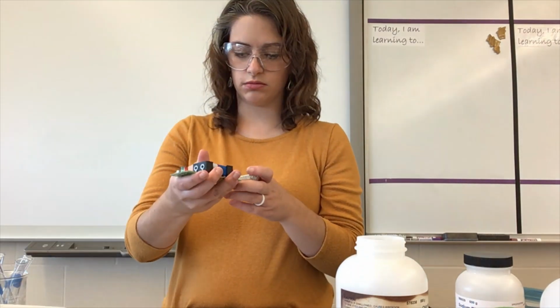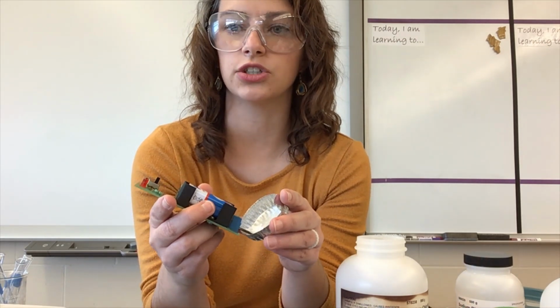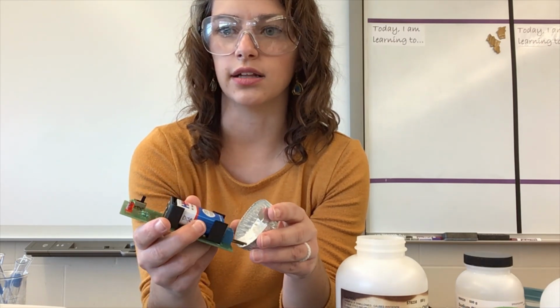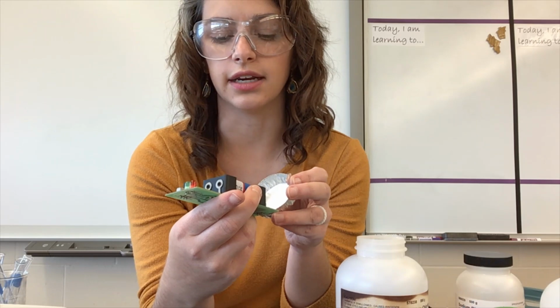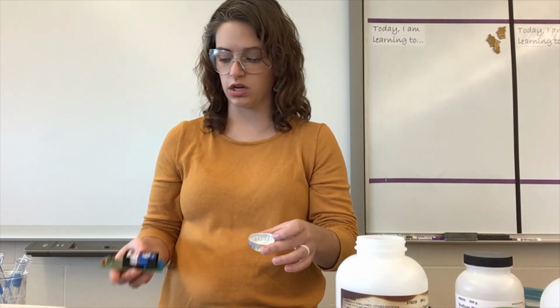Oh, no, it's good. There it goes. I just wasn't doing it quite right. Okay, so I'm going to be careful not to touch the aluminum dish, because that is for sure going to light up. I'm going to make sure that it's just in the solid. And if you look at the lights, they are not lighting up. So this is not conductive as a solid. So we will say no.